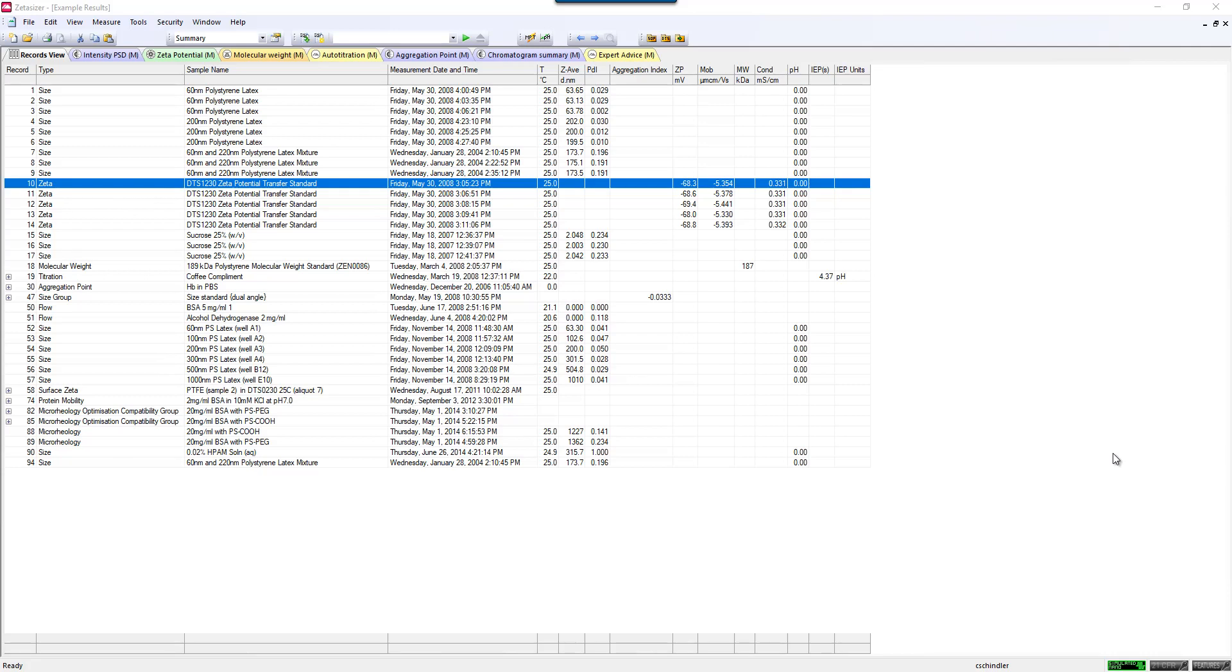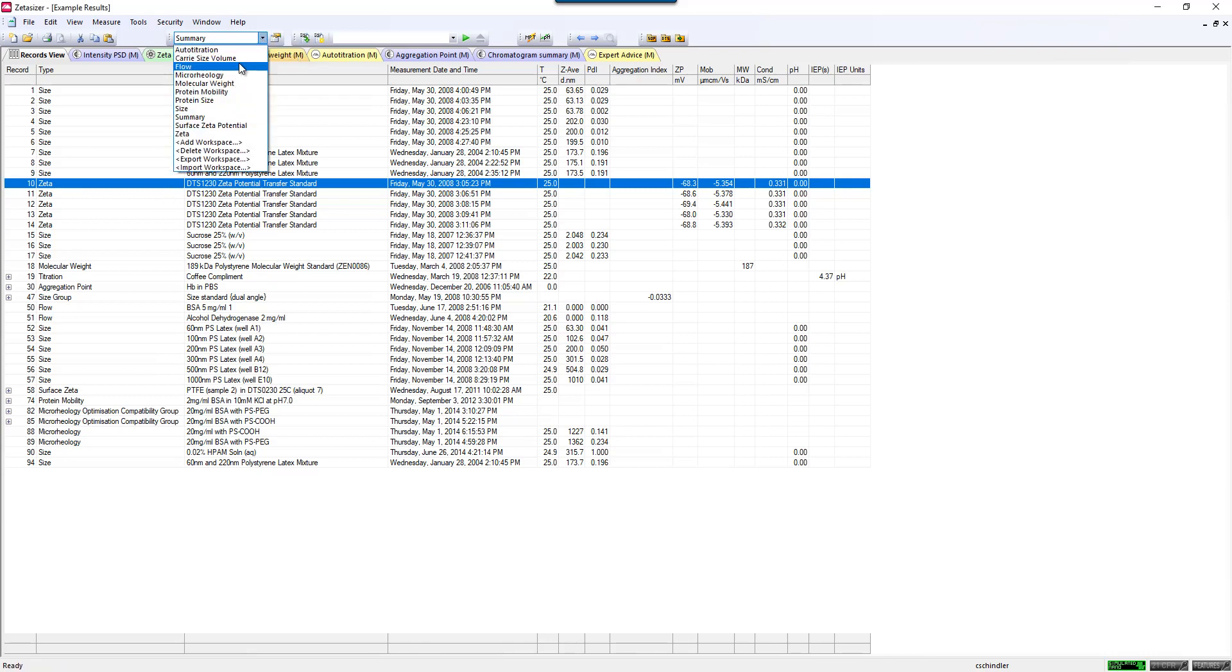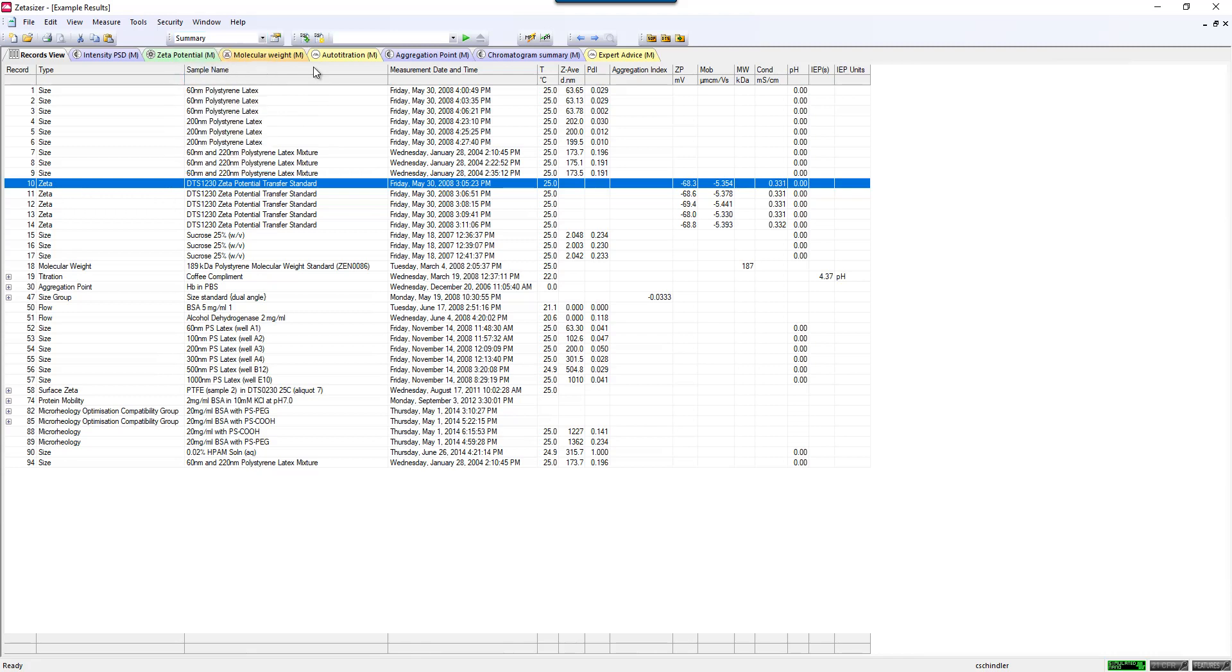This is a video discussing a lot of the customization that can be done in the Zetasizer Nano Series software. One of the first things I'd like to talk about are the workspaces, and your workspace can be selected with this drop-down menu. The workspace basically defines what types of parameters are listed in the record view and what report pages or tabs across the top of the screen are displayed.